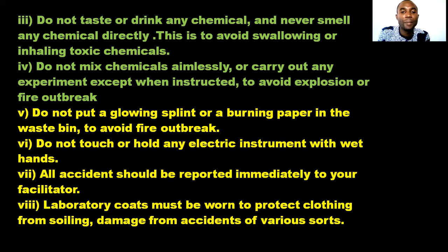All right, do not mix chemicals aimlessly. Don't just come to the lab and begin to mix chemicals anyhow, or carry out any experiment except when instructed to do so by your instructor or your teacher, to avoid explosion or fire breakouts. Never do so. Chemistry lab could be dangerous if you don't know what to do there.